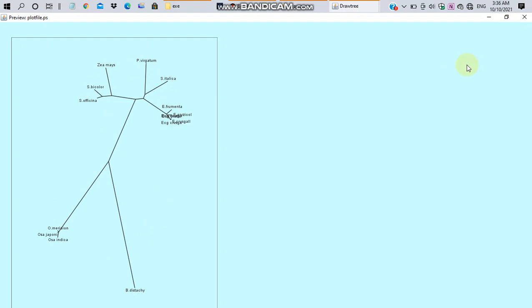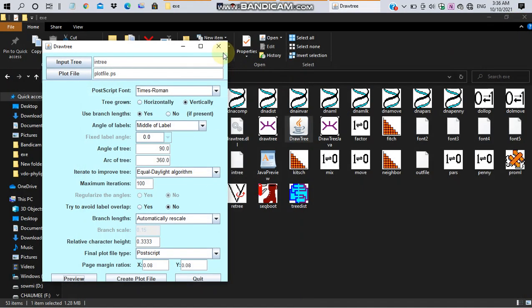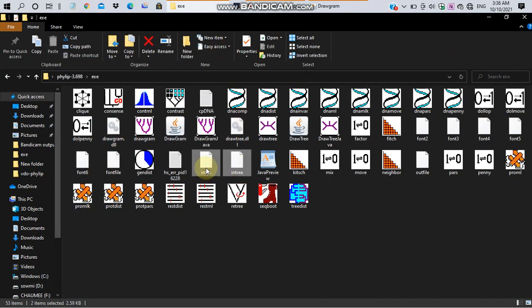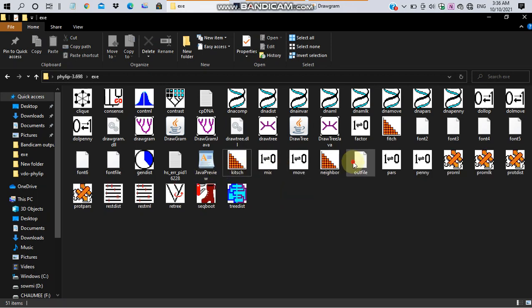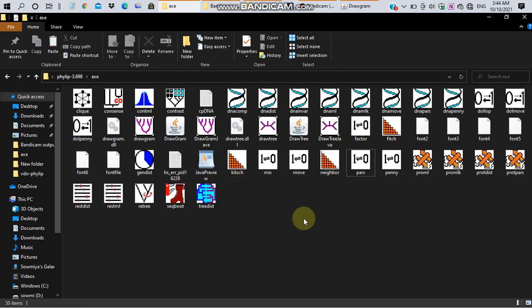Before entering into character-based method, clear all the files that are generated during distance-based method. That is infile, intree and outfile. For character-based method, we have maximum likelihood and parsimony method.